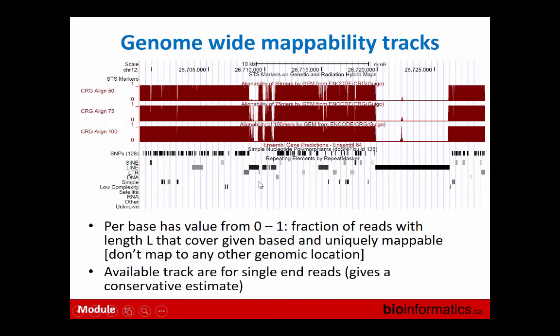And fair enough, down at the bottom here, we have the RepeatMasker track of UCSC, which shows us repeats. And there is a huge, I think it's a LINE repeat here. So that gives you an idea that you can actually assess this. For example, if you've done your experiment, you have your reads aligned, and in some region of interest near your beloved genes, you don't have any reads, you probably would like to also check whether there are repeats around. Maybe it's not that there is no data around your genes, but you can't align them uniquely.